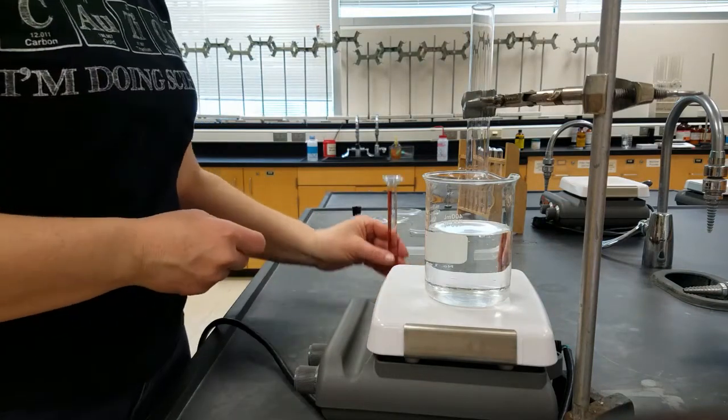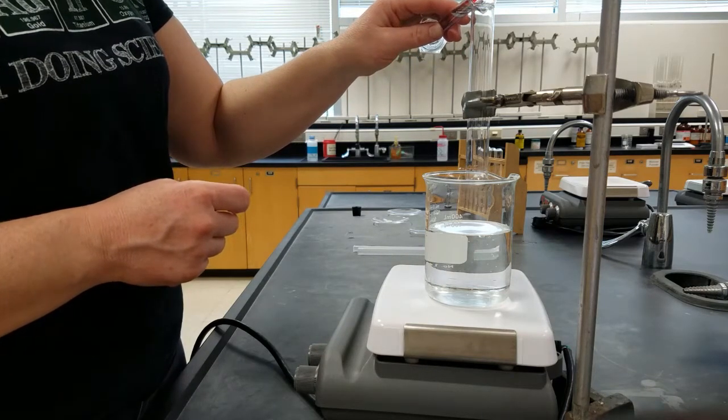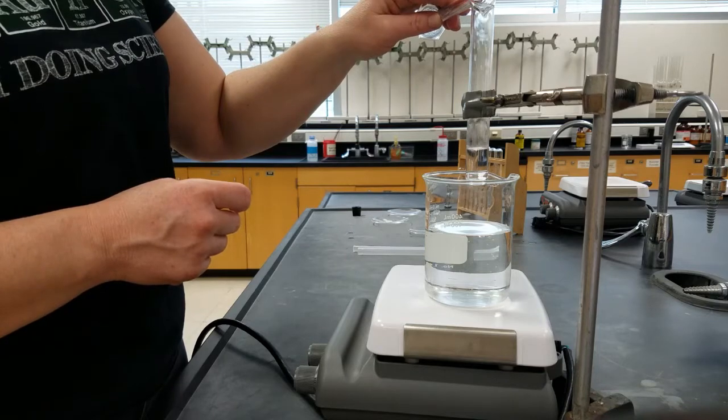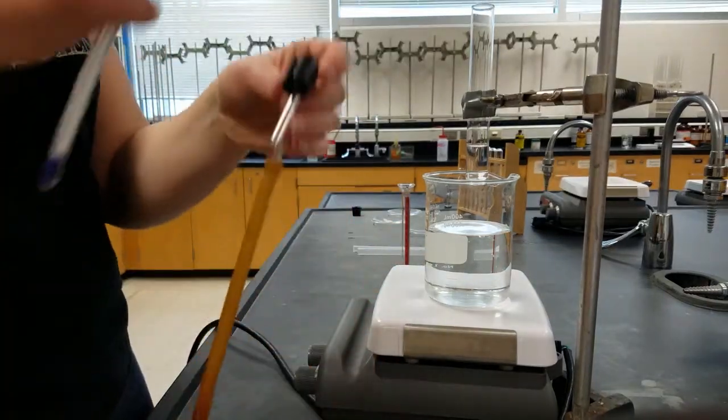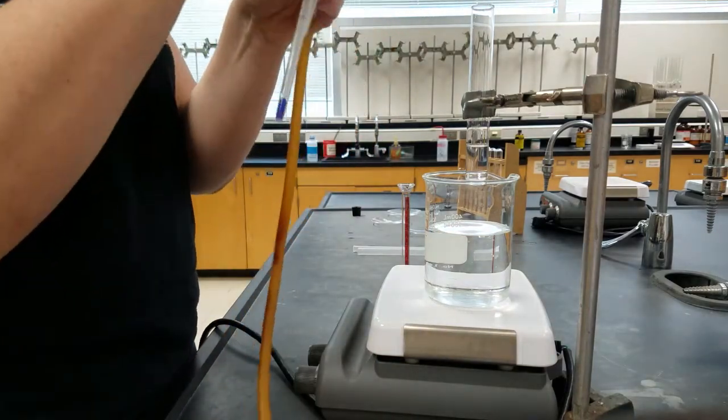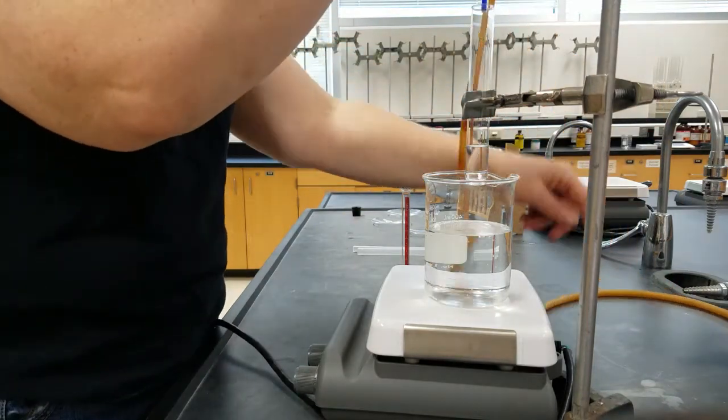We're going to add about half of our unknown liquid into the test tube. And then we're going to assemble our apparatus. So we've got our thermometer and a rubber hose to keep the vapors away from us.